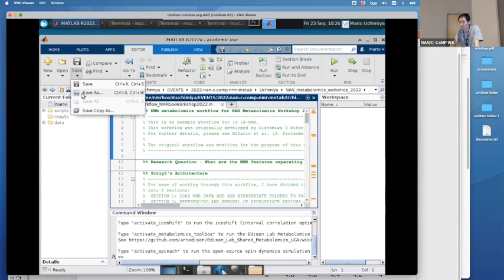And actually, Mario has his save as. One thing that I would recommend, good practice, if you have just one copy of this script, we can send you another one if you screw things up. But you can also save as, and say my copy. Then you can work with that copy, and if you find yourself messing it up, you can open up the original again. That's a safe way to do it when you're learning.